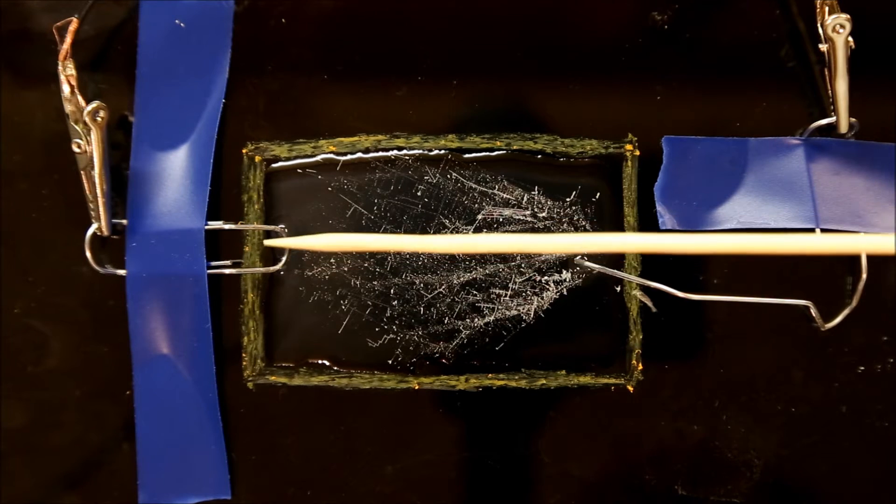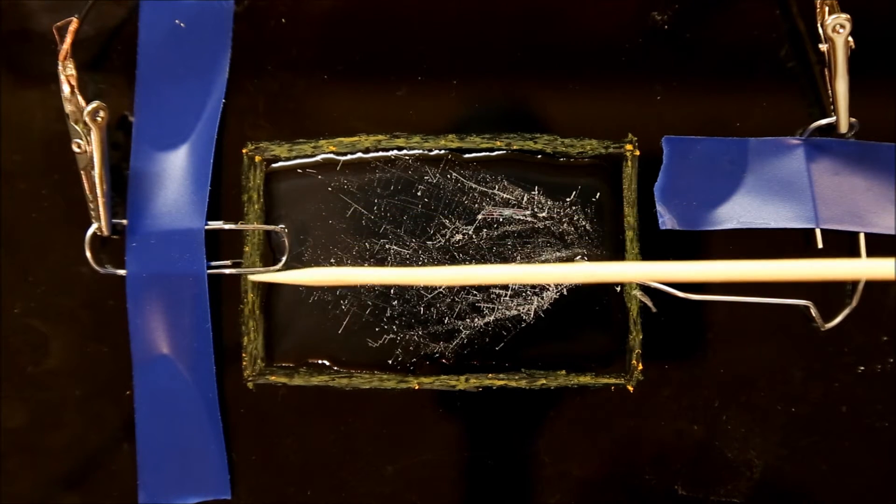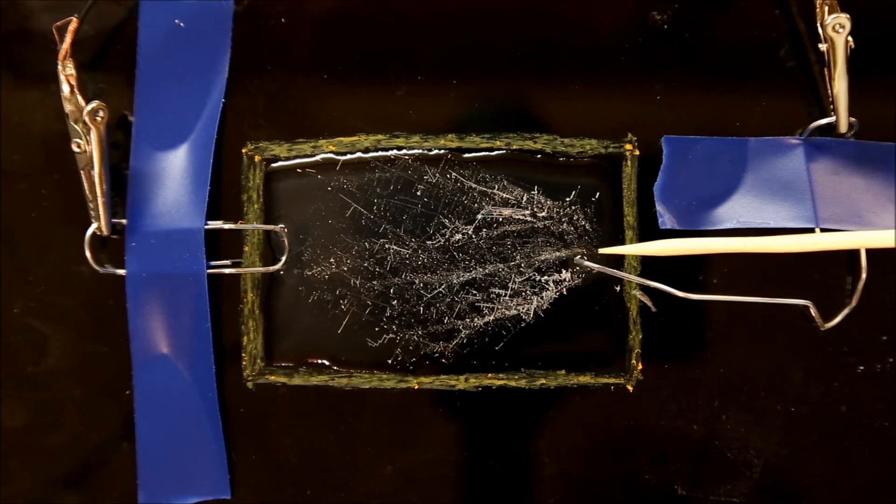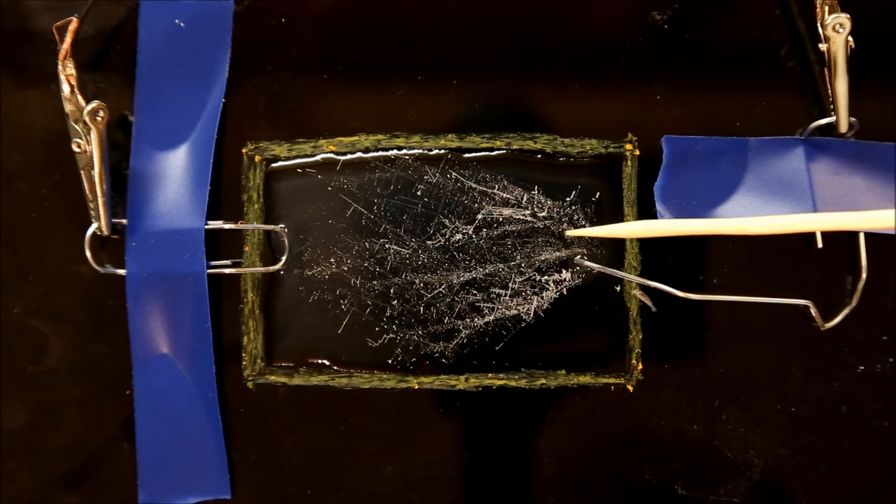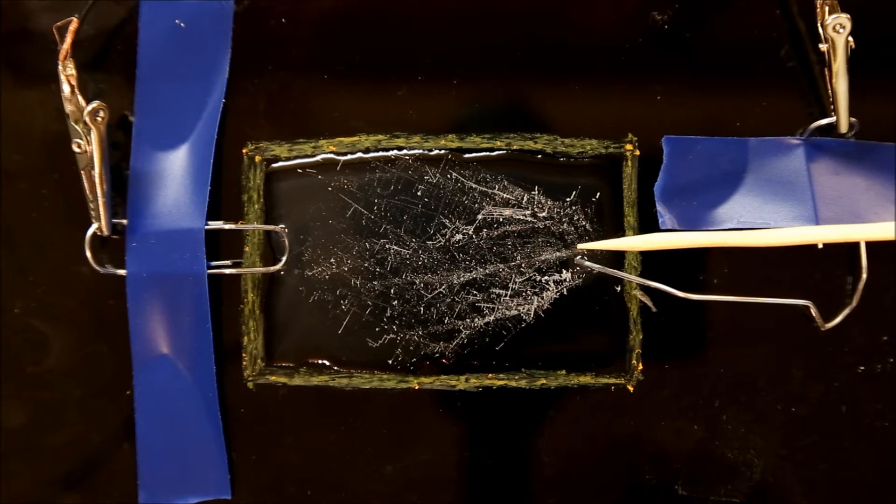For electrodes, I use large paper clips bent in a convenient shape, and it turns out it doesn't matter much whether you use smooth curves or sharp points. Once the crystals get started, they're growing in the middle here, and the electrode shape doesn't seem to matter a whole lot.